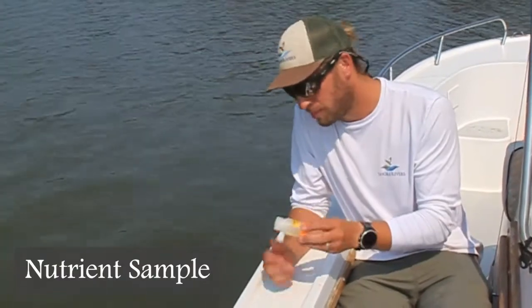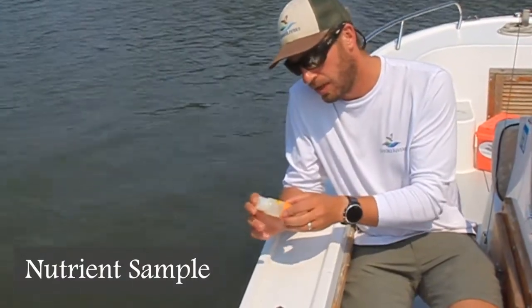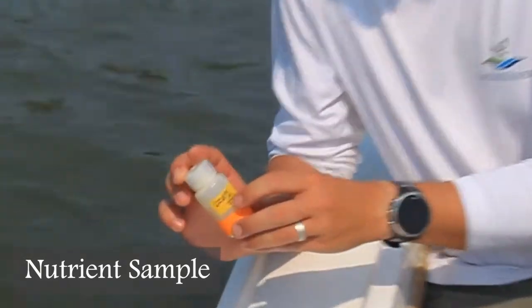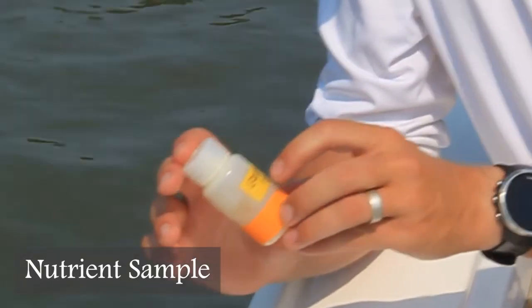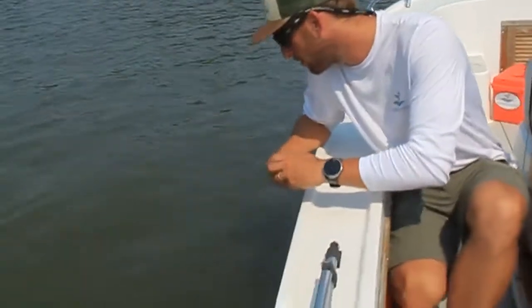Collecting our nutrient sample. So we have a 60 milliliter bottle that we use to collect this sample, and on it we have the site that we're sampling at, which is LI01 for La Trappe and Island Creek, and then the date, July 7th, 2021.